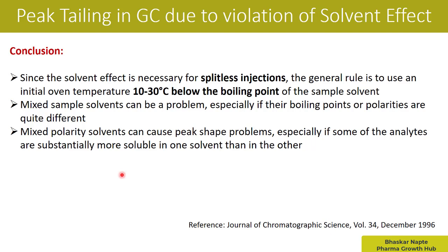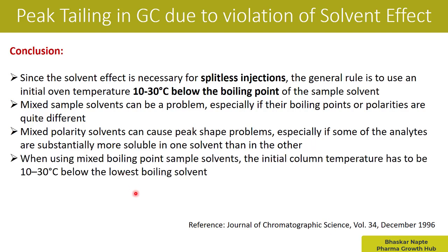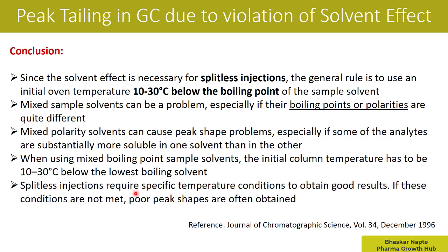The third point: mixed polarity solvents can cause peak shape problems, especially if some analytes are substantially more soluble in one solvent than in the other — for example a non-polar solvent like ethyl acetate combined with a polar solvent like water. If there is a difference in polarity and the analyte has different solubility between the two solvents, you can have a problem with peak shape. When using mixed boiling point sample solvents, the initial column temperature should be 10 to 30 degrees Celsius below the lowest boiling point solvent. Finally, splitless injections require specific temperature conditions to obtain good peak shape, and if these conditions are not met, poor peak shapes are often obtained.